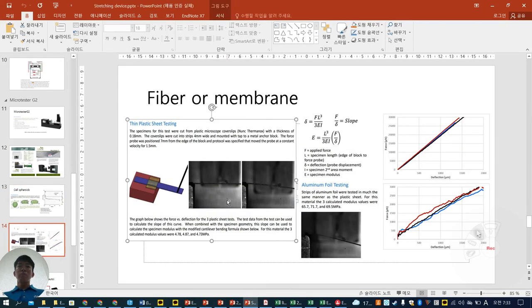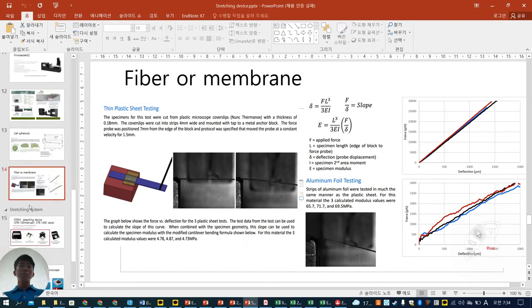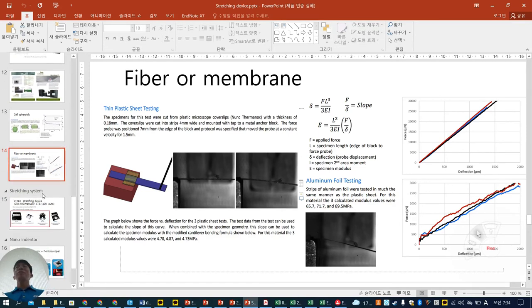And then, as you see before, fiber and membrane also, we can measure using these load-type things. Pushing here, and then we can get this data. So this is a micro tester. Same as our normal instrument, but you can measure with a little higher resolution.